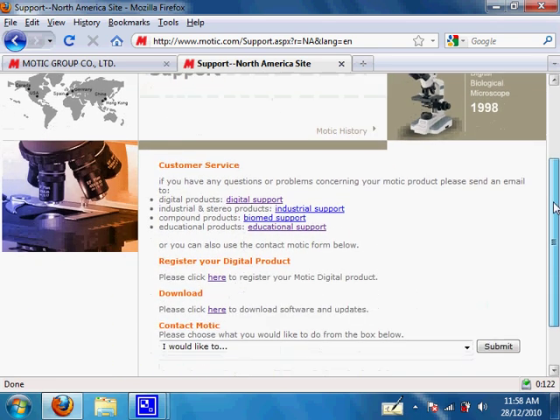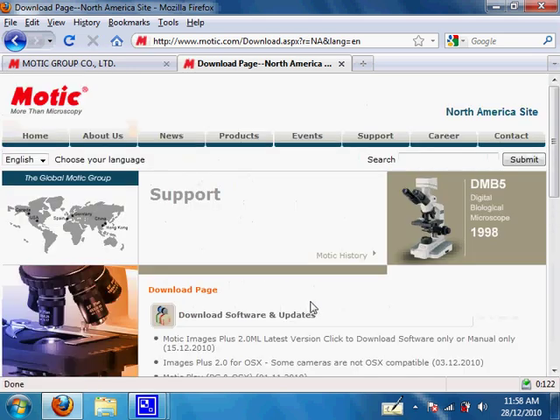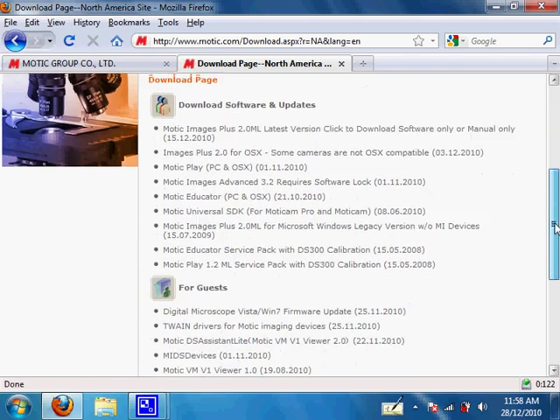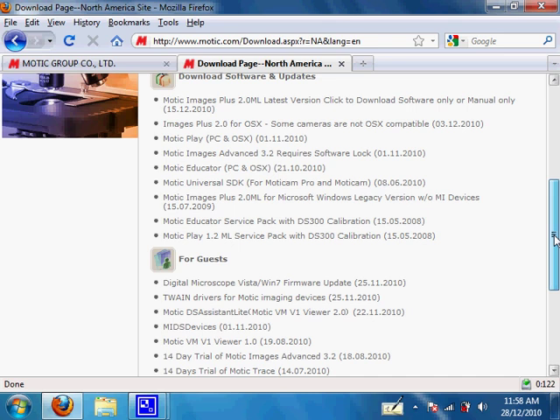Click on USA and then click on Support. Once you get here, click on the download section. Then here, depending on the model, you will need different software.